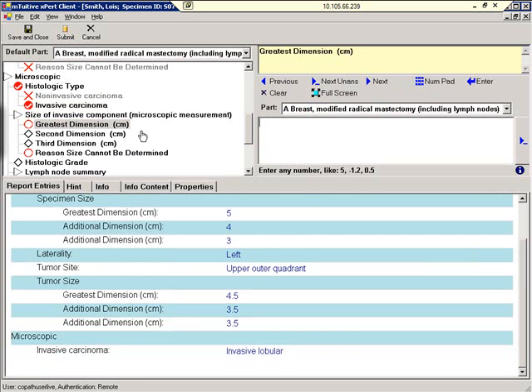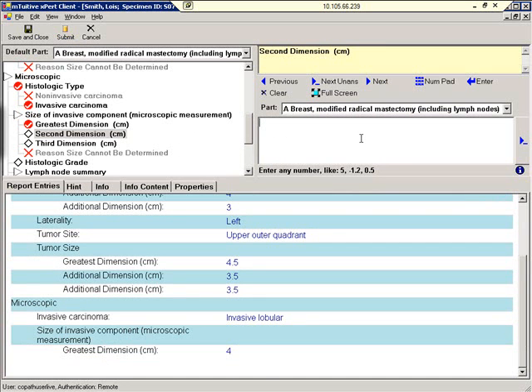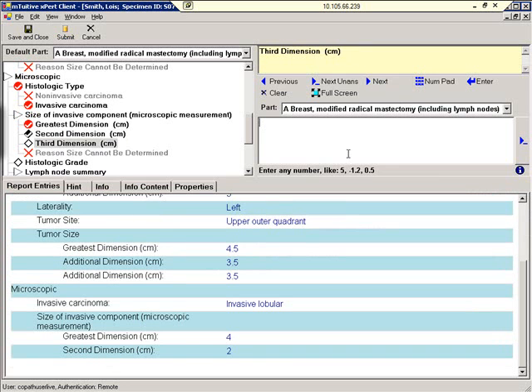Let's move on to the size of an invasive component. Greatest dimension. Four. Second dimension. Two. Third dimension. Point five.